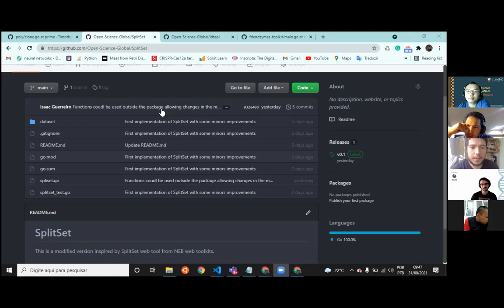Okay, and Philippines created this sequence that has the OpenInsulin sequence, and they created also this. Let me close the window. Perfect. So how do you check this? I think in the lab you have to run a gel where you could find the linearized plasmid, right? Okay.